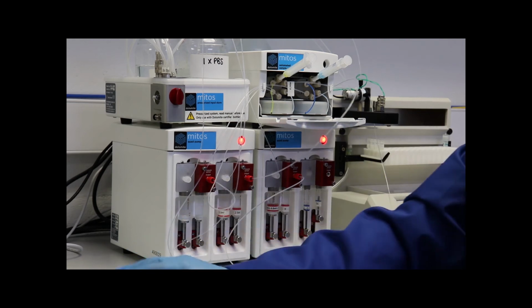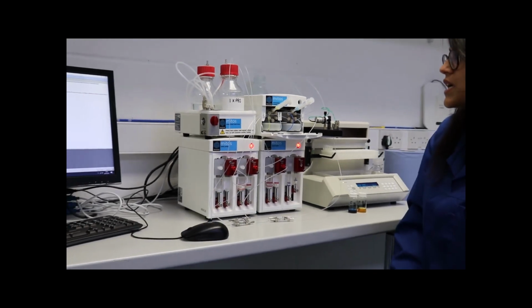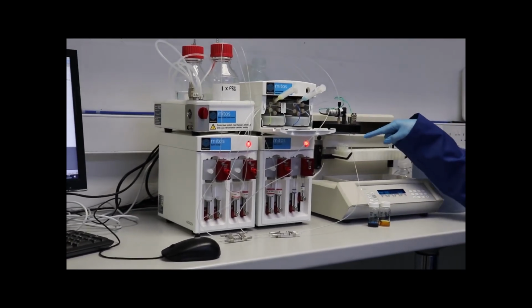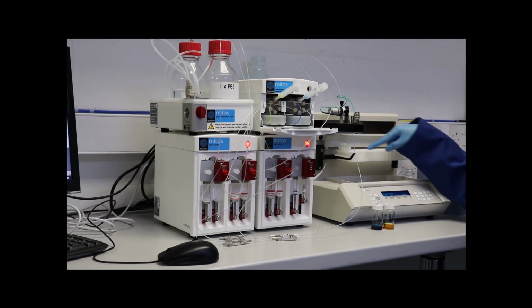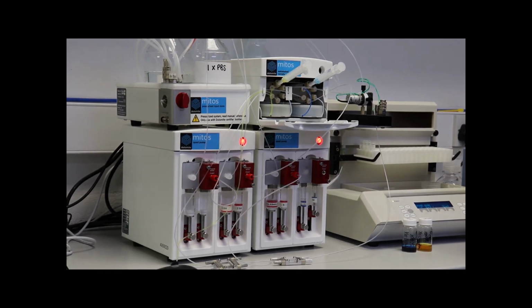Once that's done, you simply press OK on the pop-up dialog, and we just heard the automated collector move into position 1 to start collecting the first sample. Because we're doing 4 different experiments, I have lined up 4 different vials. These are just simple 1 ml cryo vials that we use.